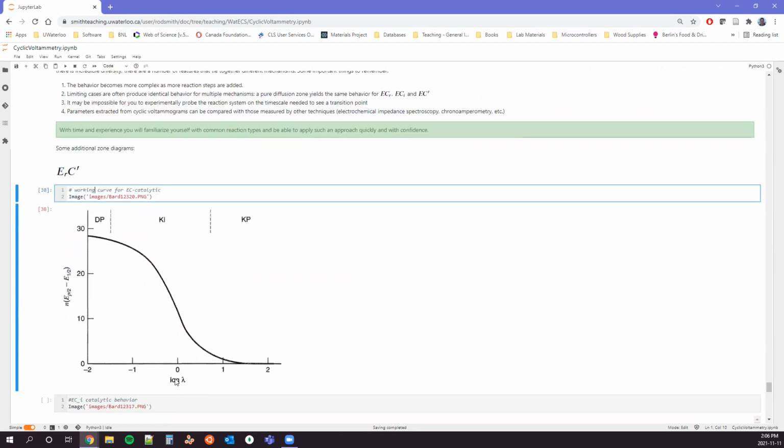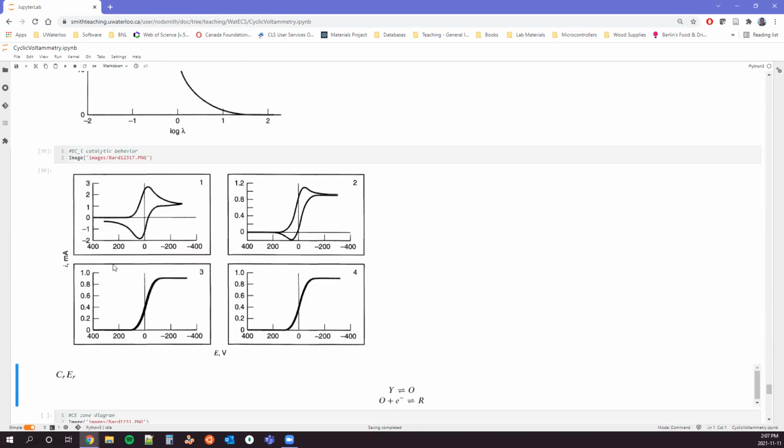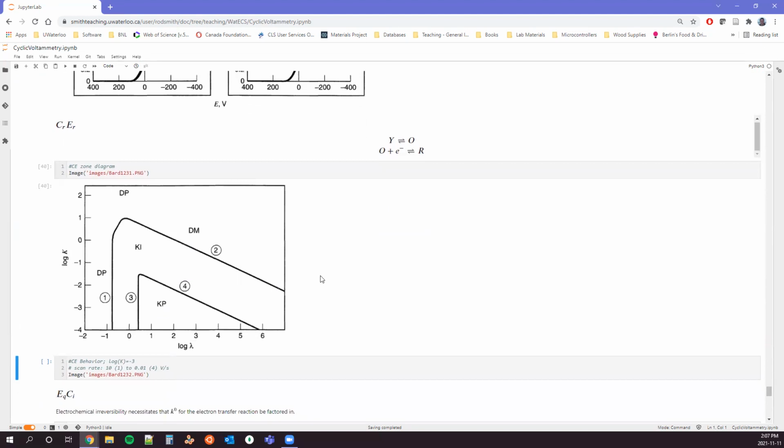So here's another example, so cyclic voltammetry. And so for our kinetic situation, taking a working curve and we're looking at the shape of our peak versus our dimensionless kinetic parameter. So we have pure diffusion, we have pure kinetic, and we have this intermediate transition zone. And what we look at for the irreversible here, when we're doing kinetic, the key is there's no peak, right? And so we get this limiting behavior where we exponentially go upwards and we hit a plateau. And so this plateau will be either a kinetic limit or a mass transfer limit, depending on the system you're working on. We can flip it. We might have a chemical reaction first, followed by an electrochemical reaction. And so here's our first example of a complete zone diagram, right?